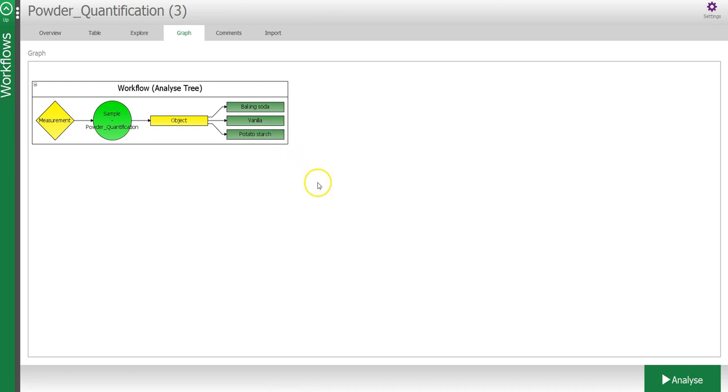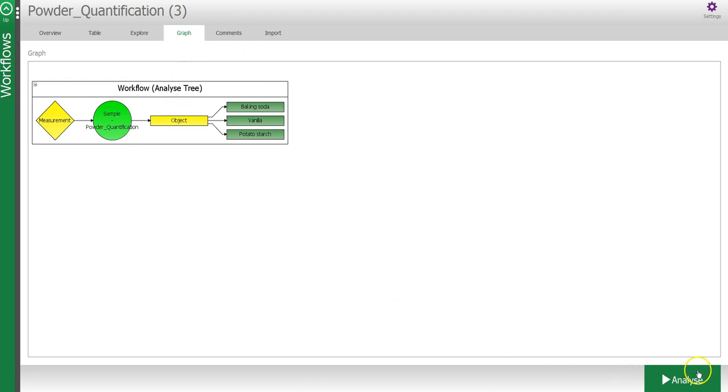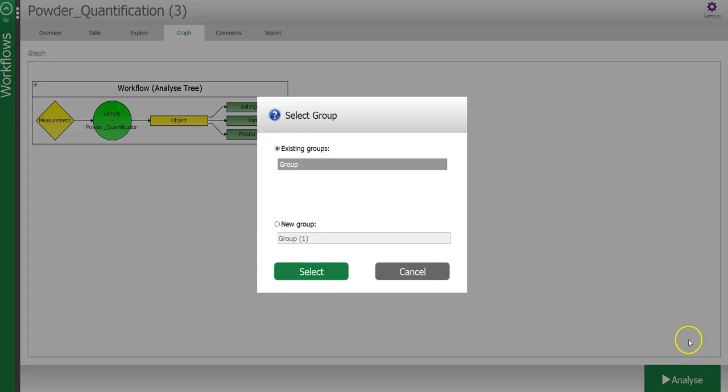In addition to analyzing images that are already recorded on your hard drive, you can also use Breeze to analyze images in real time directly from the camera. If your computer is not connected to a camera, you can simulate this by using the camera simulator in Breeze. I will generate a new group here called real time.